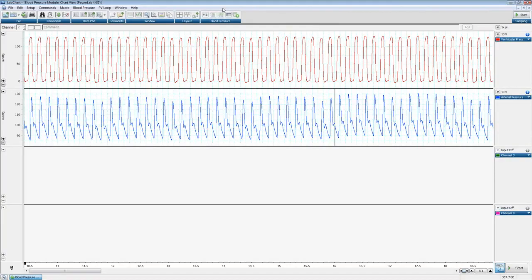I left-click that, and we get toolbar icons for settings, classifier view, analysis view, the table view, and also to analyze. If I right-click again, we can also do that for PV Loop. These are little shortcuts, easy toolbar tips, so we can click here and go to specific views or settings for both instead of having to go to the actual menu.